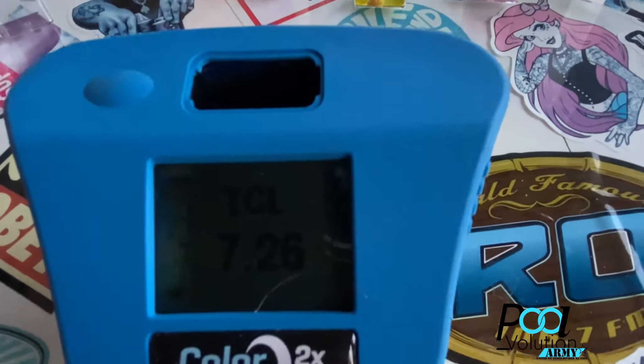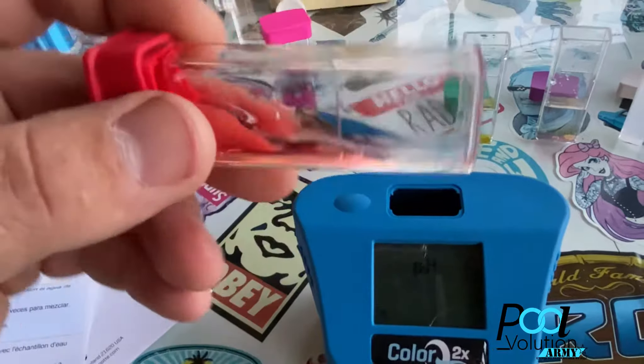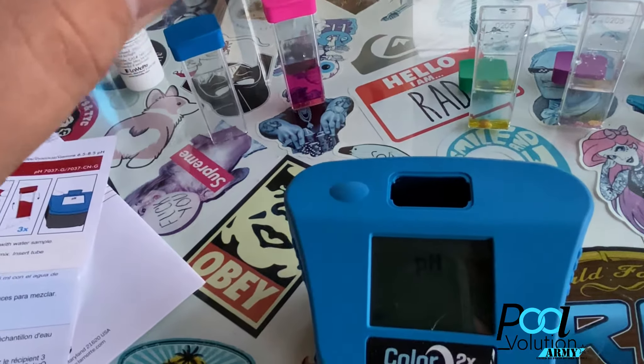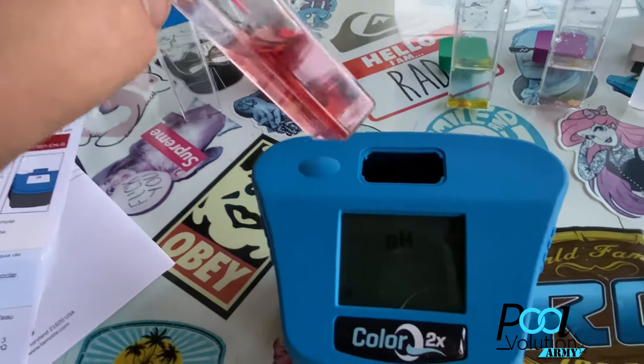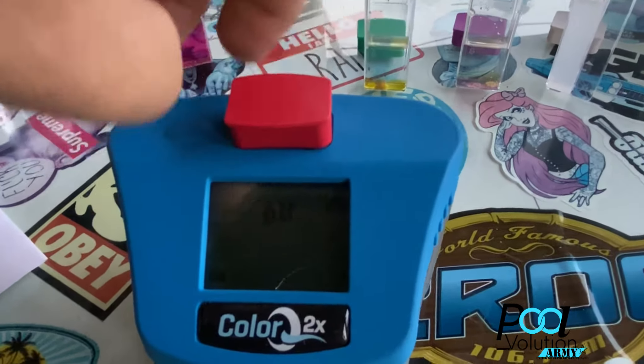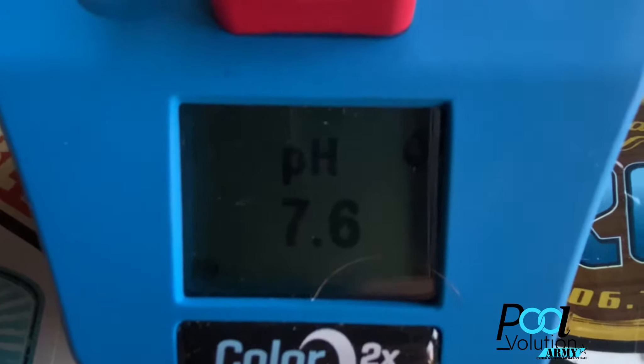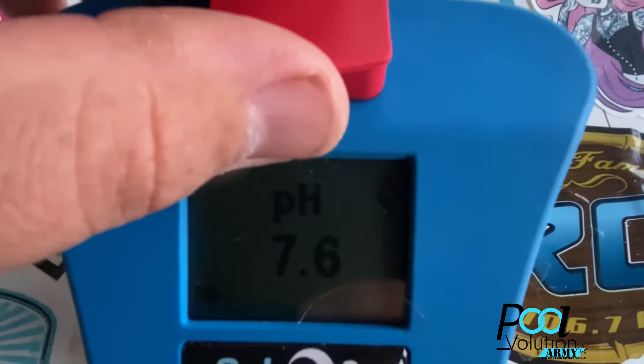I skipped the bromine — I just left the photometer blank, hit the button once, and it went straight to pH. You hit the button once and now it's going to do the pH reading. Pretty simple, easy to use.